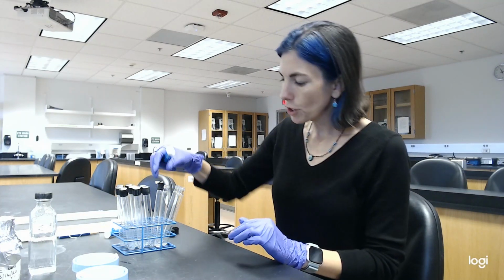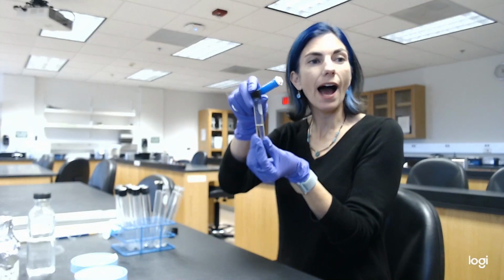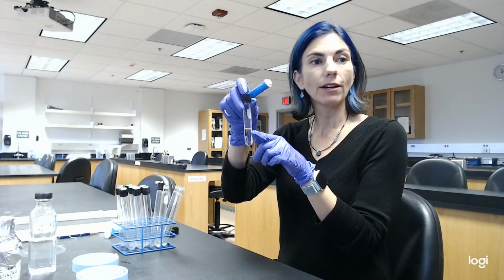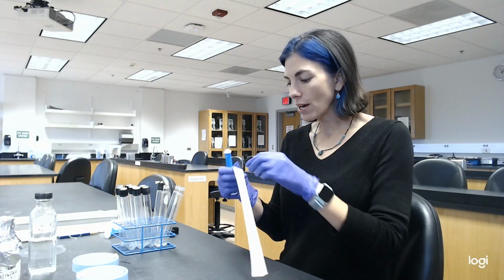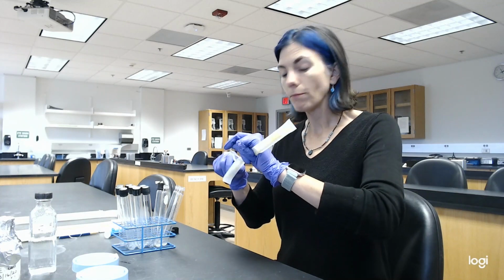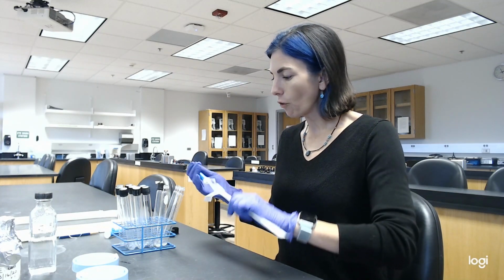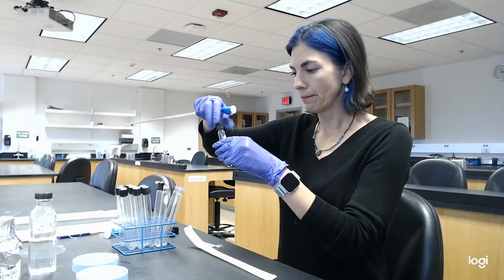Okay, to my control, I'm going to add 1.5 milliliters of nutrient broth. Again, E. coli should grow really well in this, so that will give us a good baseline for how well E. coli is going to grow.